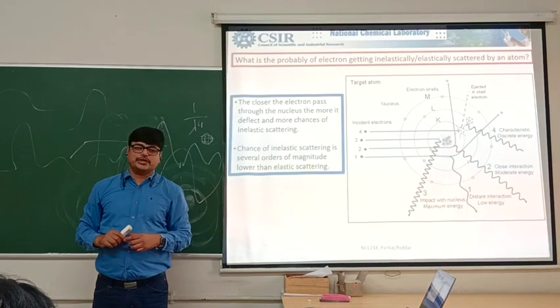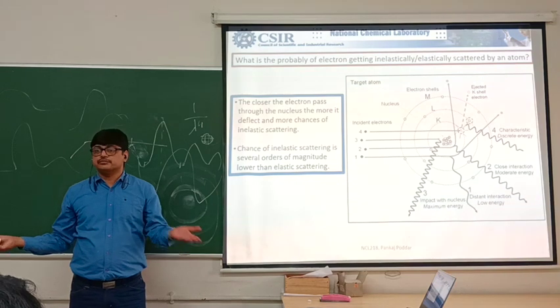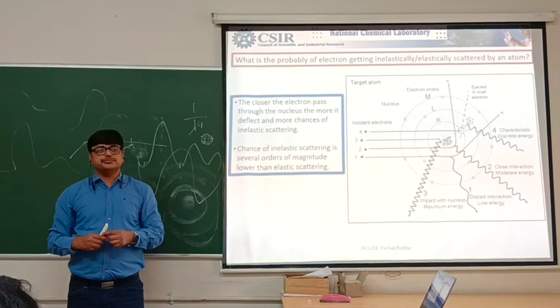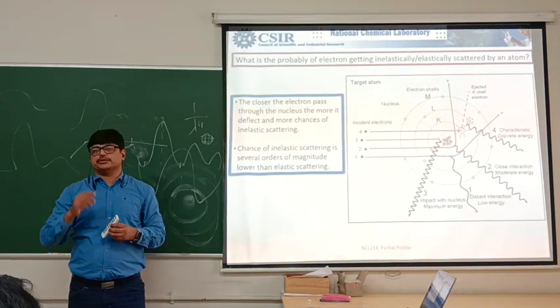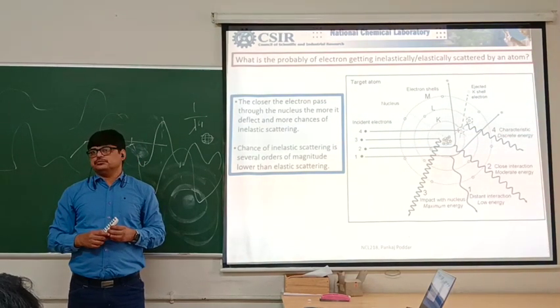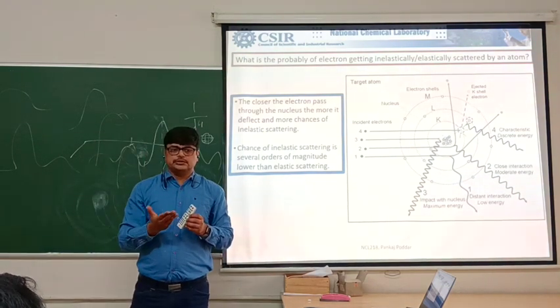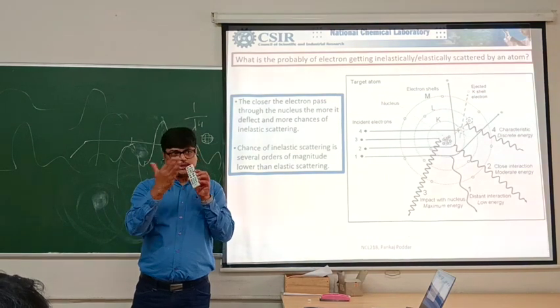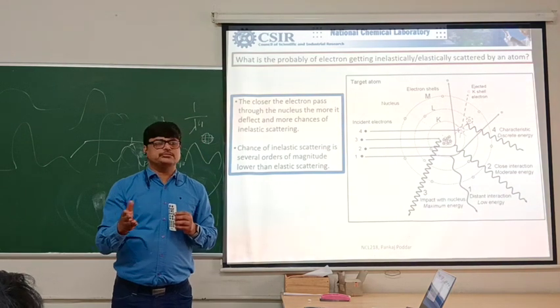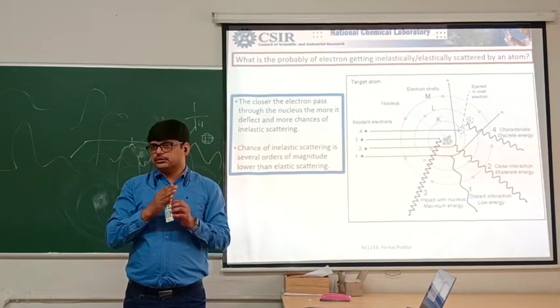So look at this innocent question that led me to such a big problem in electron microscopy. Asking deep questions actually. So it's the biggest problem in scanning electron microscopy. And to answer your question, another solution in scanning electron microscopy is that they coat the entire sample with 5 to 10 nanometers of metal. Not carbon, but gold, palladium, platinum. Okay? So they put a thin layer.